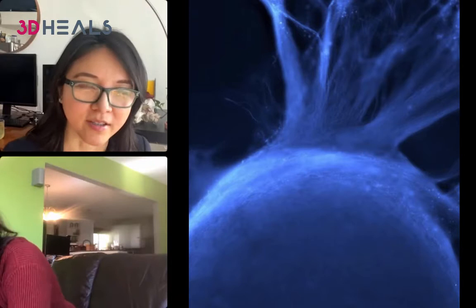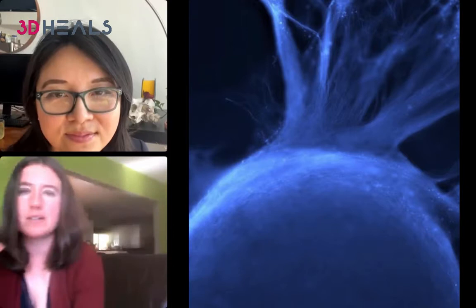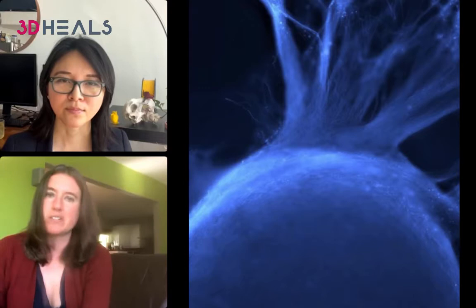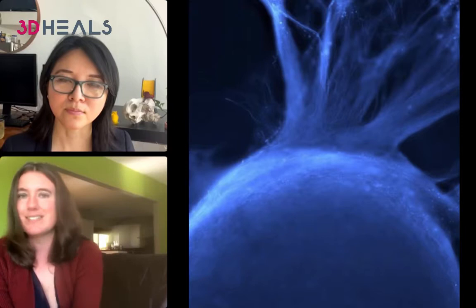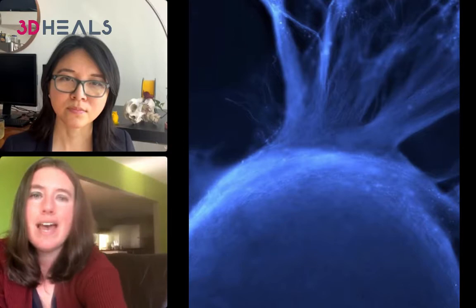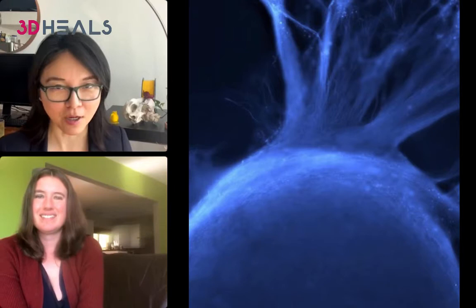Organ on a chip is where you're getting in these microfluidic systems where you're miniaturizing the tissues. You're usually looking at these devices in the micro scale, and you'll have some cells present. The nice thing about being in miniature, you can actually have multiple cell types present, and you can have a tissue chip that's your liver versus your kidneys and string them all together, although there are still challenges getting all your things to work in the same place. Since you did bring up microfluidics, I do have one of the Aspect microfluidic print heads. Essentially, you have these little plastic chips that have different channels, and you can fill them with cells. In the case of Aspect, they use it to deliver your bioink. You can culture them just like you would normal cells, but they're miniature. So it saves money, because you're using less resources. That's your organoids, your microfluidics, and there is a whole subset of bioprinting where they use these microfluidic print heads to make complex tissue models.